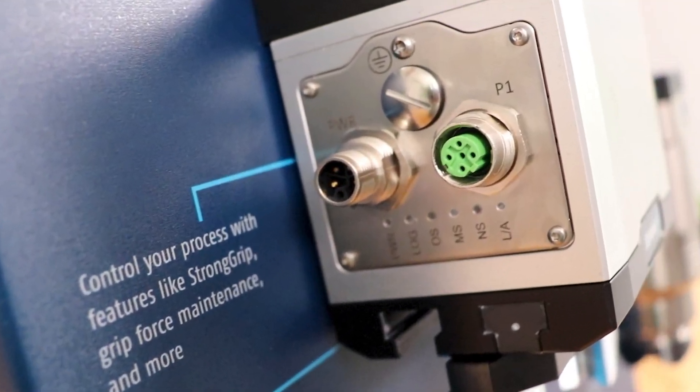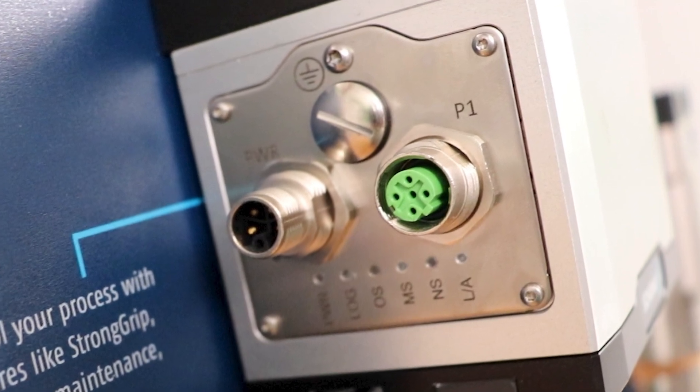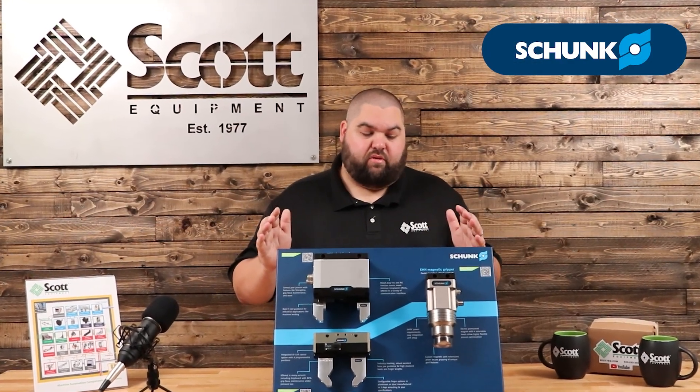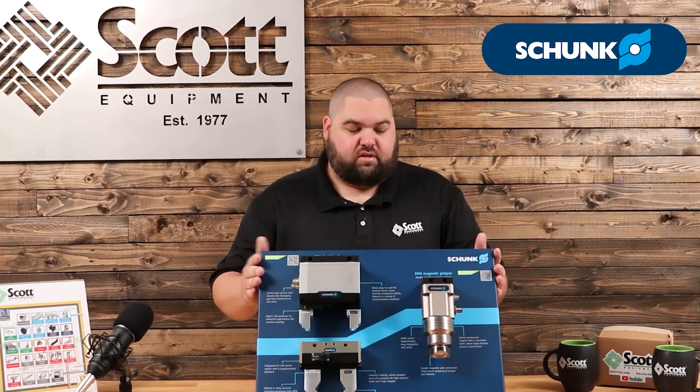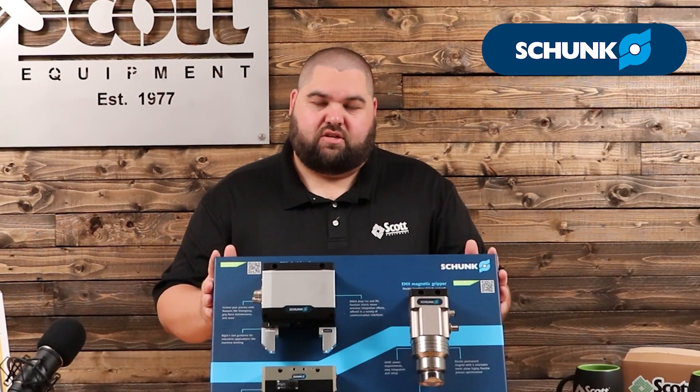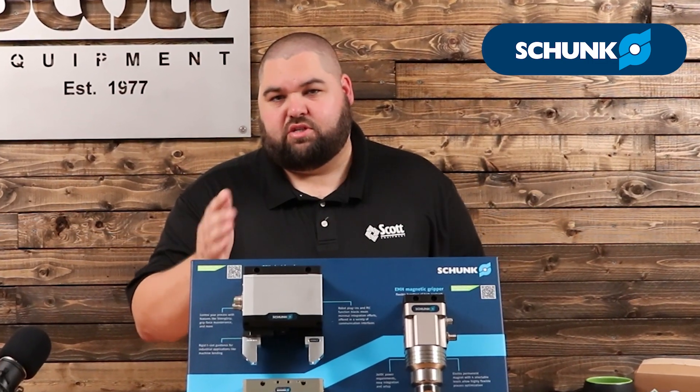Shunk offers multiple robot plug-ins and PLC function blocks to simplify your integration. For more information, reach out to your local Scott Equipment account manager. This demo board will be available in our demo van, so get a visit scheduled or we can come in and do a demo of just the gripper itself.